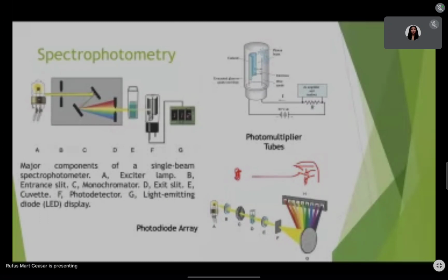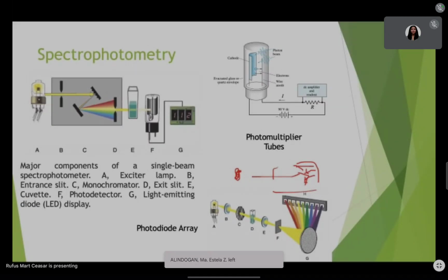Pero yung intensity ng secondary electrons, relative pa rin dun sa incident na electrons. So, hanggang dumami, kasi madami yan, nakapalibot yan sa isang circle, paikot-ikot yan. Tapos, ang ginagawa niya lang, basically, ang key takeaway doon, ine-enhance niya yung signal. Or ina-amplify niya yung signal. Usually, sobrang taas from the initial na electron na signal.